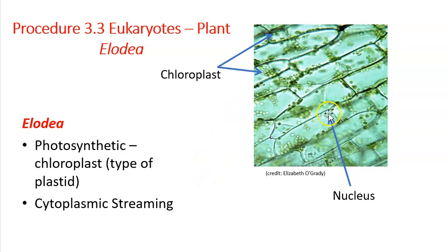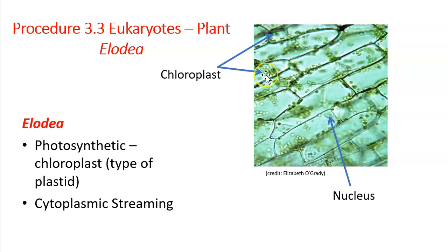We can see the nucleus. Remember that all cells are going to have DNA or genetic material. In this eukaryotic plant cell, that genetic material is housed within the nucleus. You also see these smaller green circles — these are a type of plastid, an organelle responsible for making or storing carbohydrates. These are chloroplasts, where the process of photosynthesis actually occurs in eukaryotic plant cells.